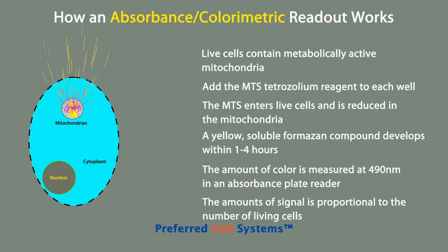The assay can be normalized by performing a cell dose response curve at the time the samples are measured. Compared to an MTT assay, which also incorporates the production of a formazan compound, no solubilization step is required. The MTS assay is a single reagent, single-step assay.